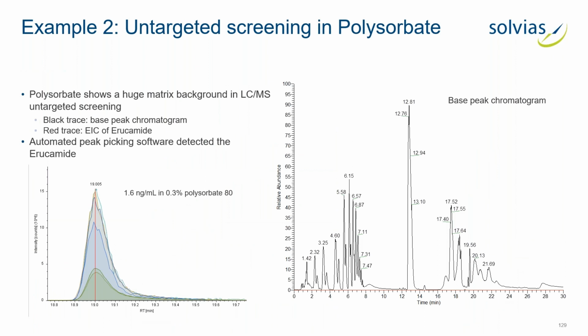This is another sample. This is the polysorbate to show that it also works very well in LC-MS. The people in the first lines, maybe second lines with very good eyes, can see a red dot at, let's say, 19 minutes. There is a small one. I promise you it's here. Maybe you can look later if you want. I can put this back and people can come in front and see, yes, there is one.